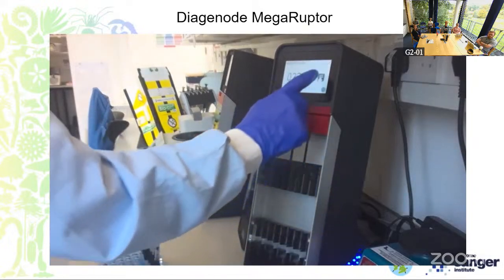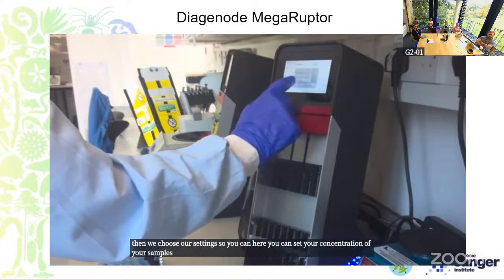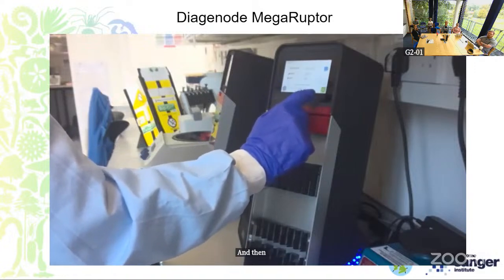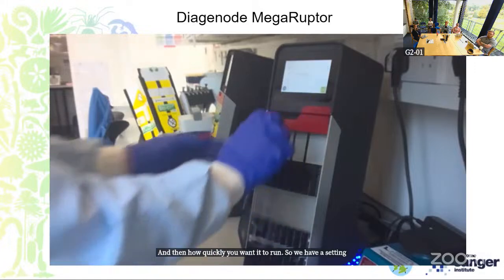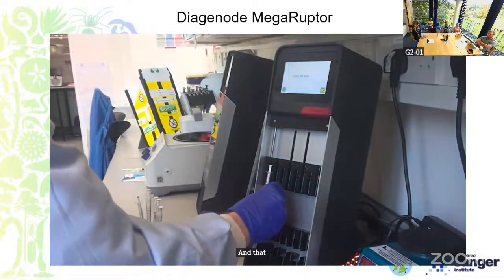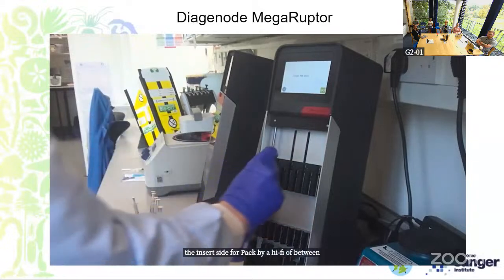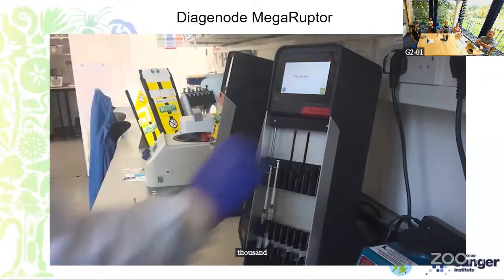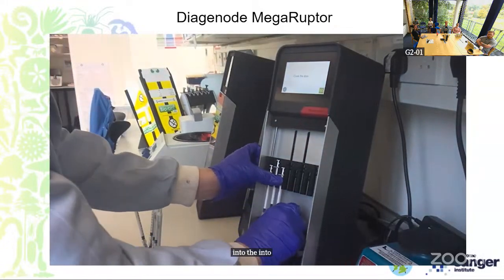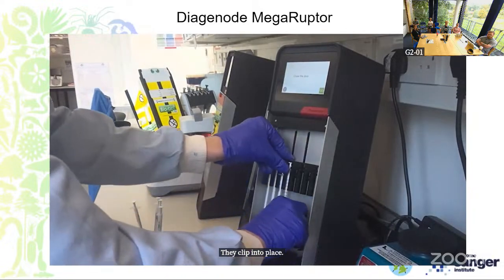Then we choose our settings. Here you can set the concentration of your samples, the volume of your sample, and how quickly you want it to run. We have a setting of 31 for our samples, and that should give us the insert size for PacBio HiFi of between 12 and 20,000 bases. Samples are then loaded into the instrument. They clip into place nice and firmly.